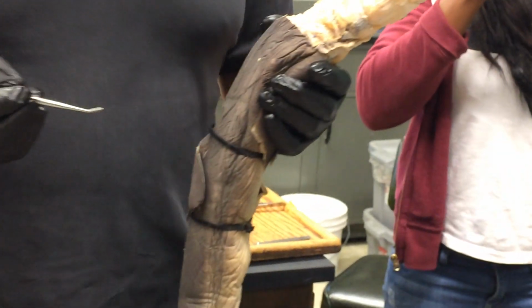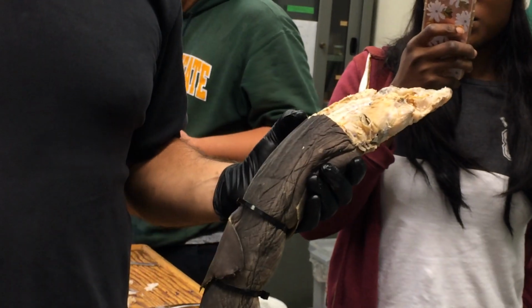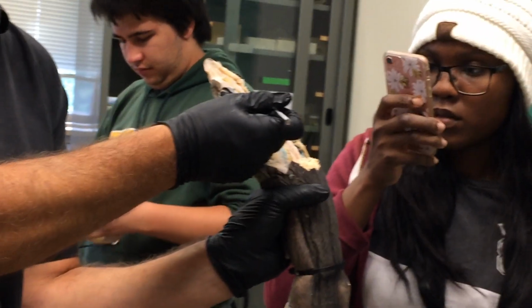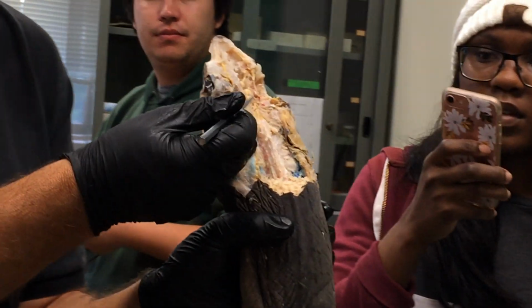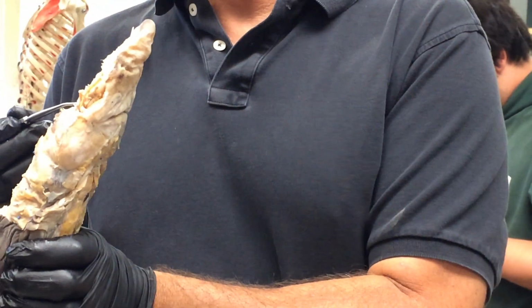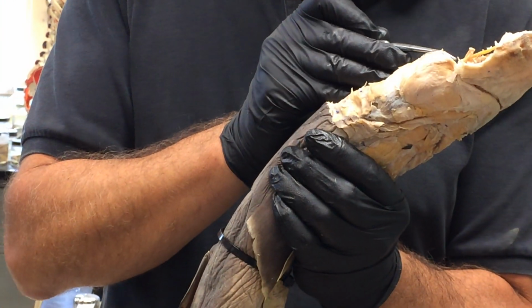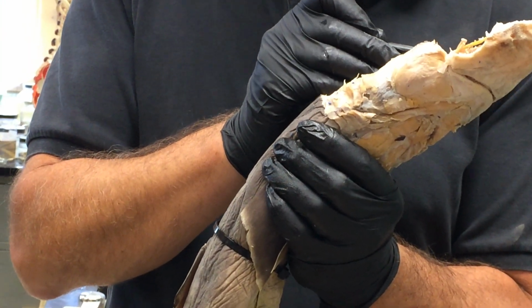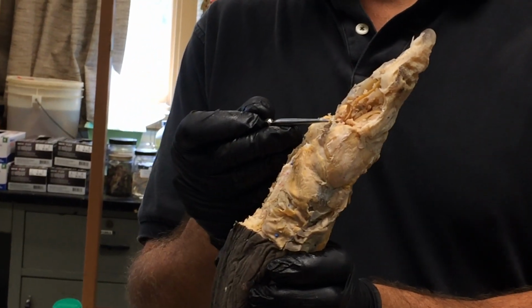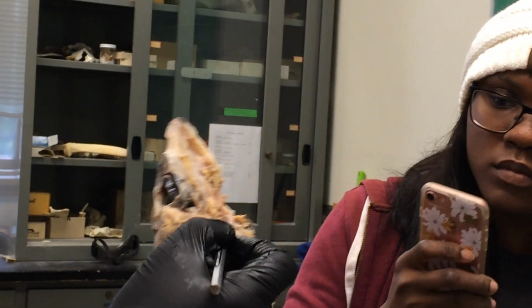Okay. Cool. Mesencephalon, then metencephalon comes next. And the main thing we see of the metencephalon is this big football-shaped structure here, and that would be the cerebellum. And that part of the cerebellum that looks like a football is called the body of the cerebellum. There are these little things that stick off to the side, you can kind of see it here. This little blob sticking off to the side. And that's called the auricle of the cerebellum.